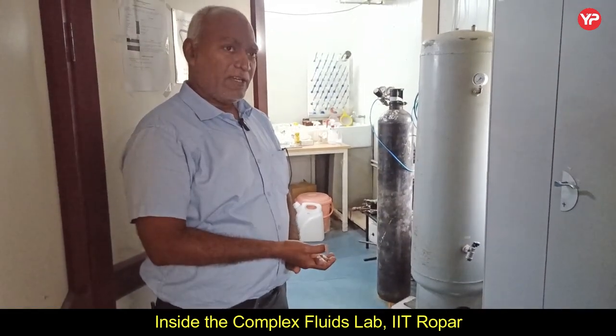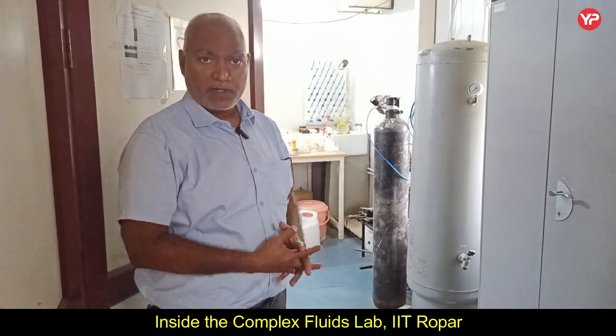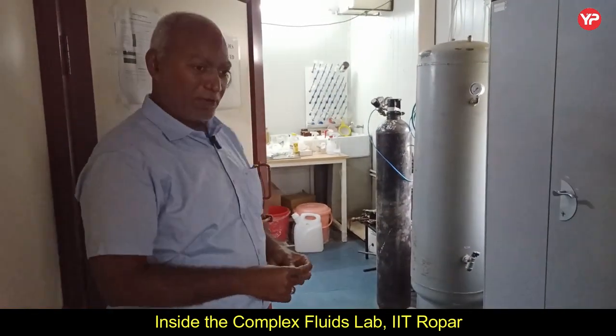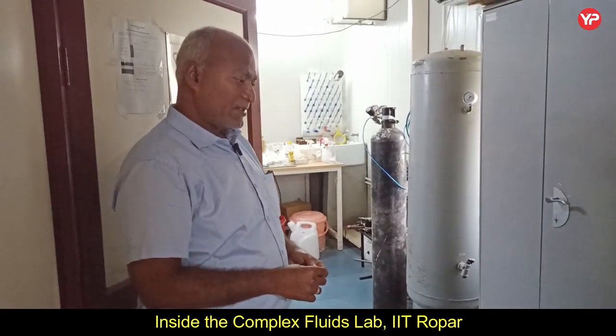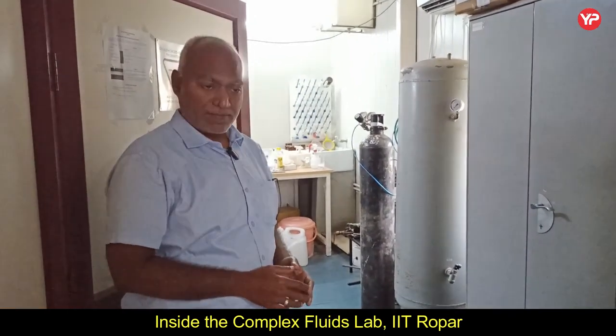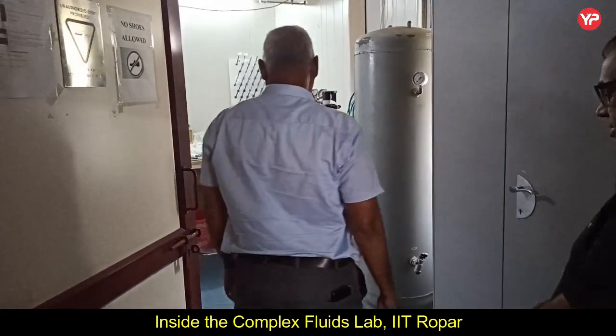So here we study fluids which are not Newtonian, which do not follow Newton's law of viscosity, and specifically we study here active particle systems. I'll show you.